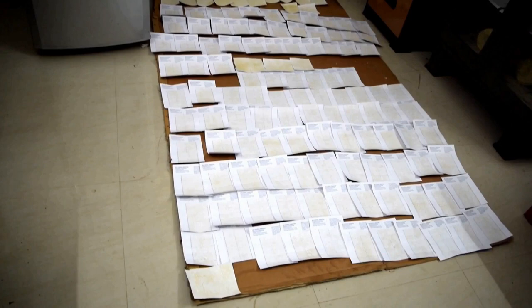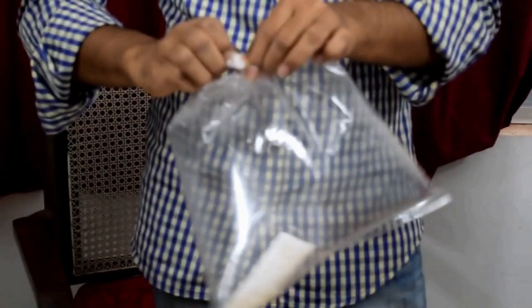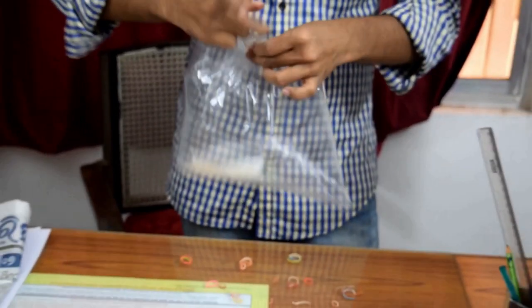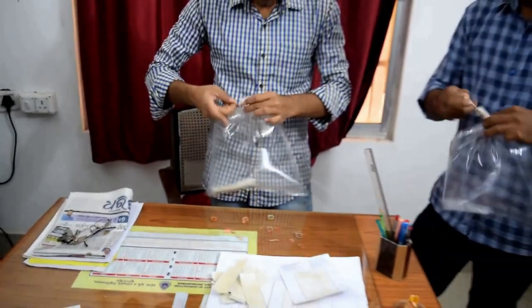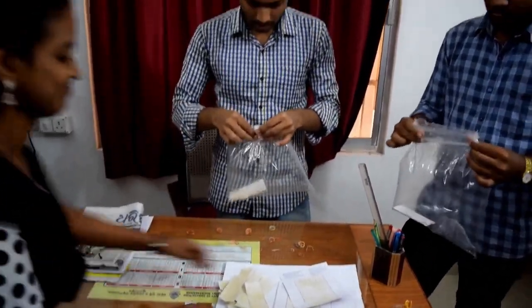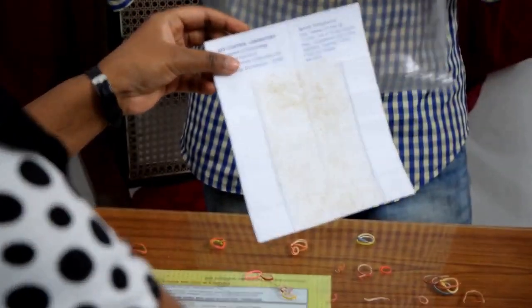The newly prepared inoculum cards and trichocards are dried inside the laboratory under ceiling fan. The Trichogramma adults start emerging from the old inoculum card inside the polythene bag in 2 days. The bag is opened and 1 new inoculum card and 2 new trichocards are inserted into the bag.